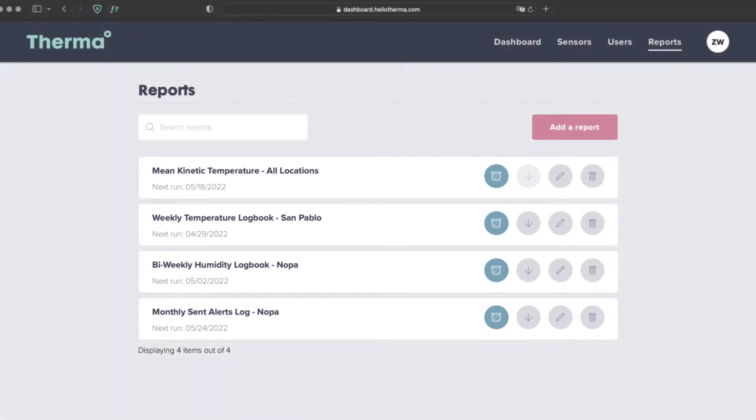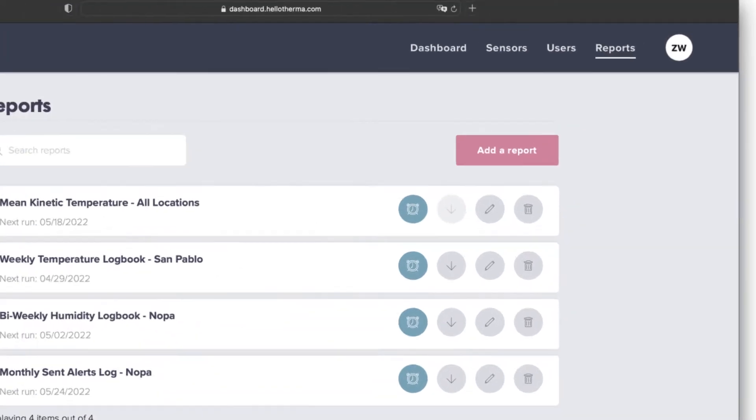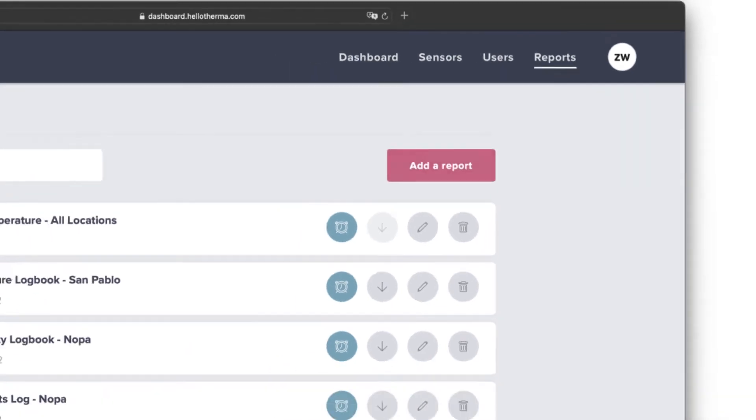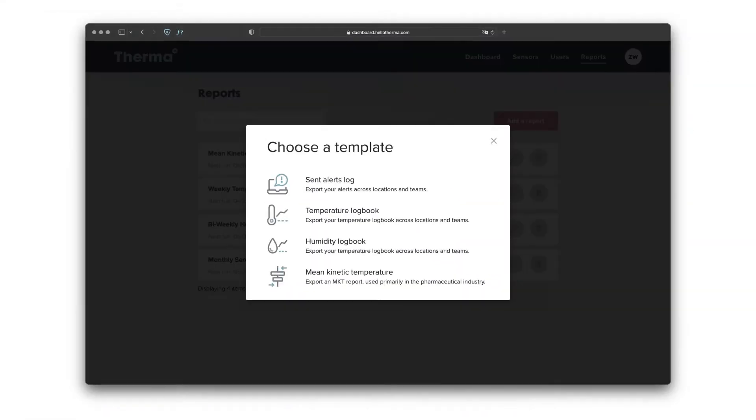To add a new report, select the button on the top right. Choose the report template that you'd like to use.